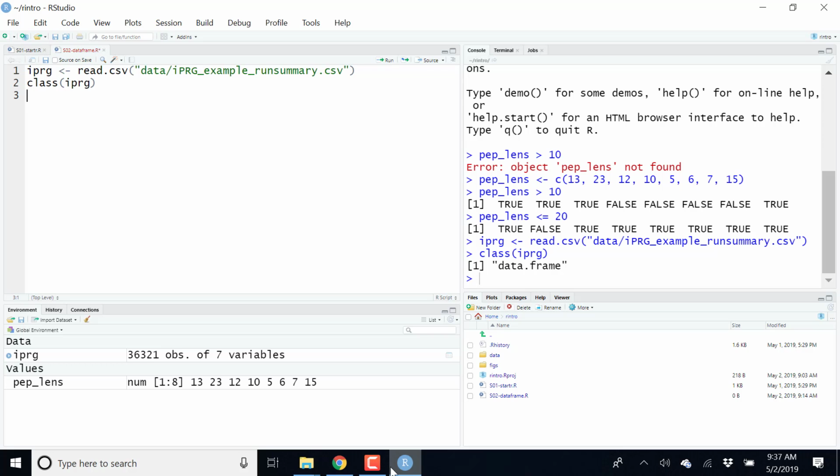And so, based on the questions you had, very often in omics data analysis, proteomics in particular, we have these kind of tables where we have our different proteins here and then samples. Samples 1 to P, proteins 1 to F. Very often we have a table like that.